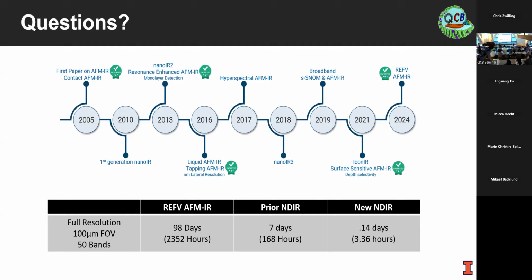The length scale is proportional to the pulsing frequency of the laser. So if you do other pulsing frequencies, you can recover signal from different depths and laterally. And then potentially take those measurements at multiple pulsing frequencies and invert the frequency dimension to recover depth.